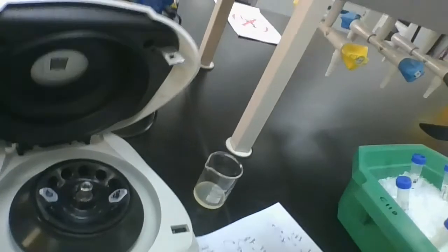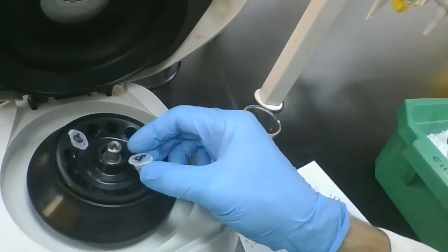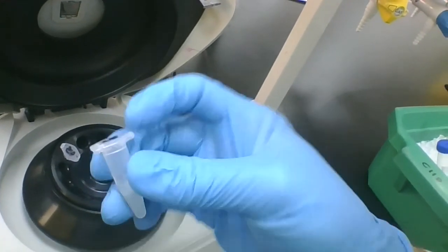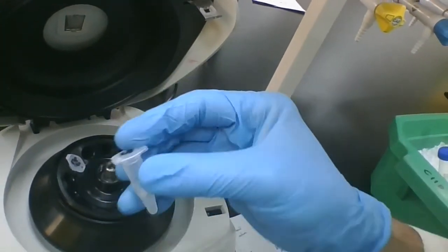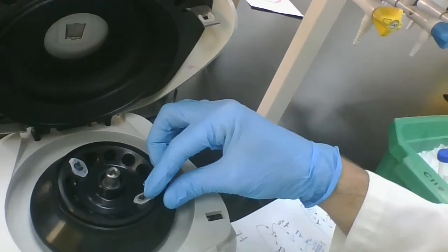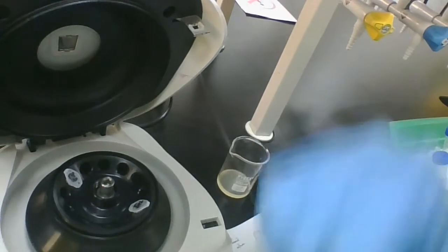And one of the things that I try to do whenever I do any kind of centrifugation is to put the hinges down towards the outside in the rotor. So just to show you what I mean by that, let's try using this camera. Okay, so I'm recording this using my laptop, so it's not easy to do. So this is the hinge over here. I'm going to put it into the rotor in a way that the hinge is pointing to the outside. And on this one, same thing's happening. The hinge is on the outside of the rotor.